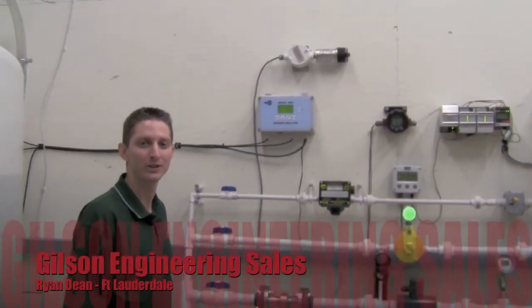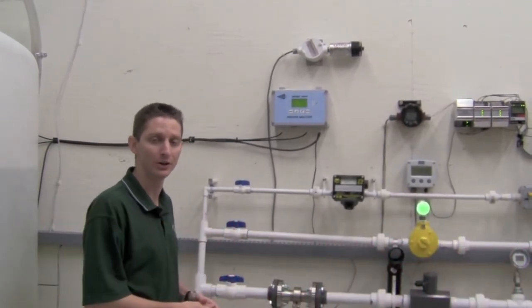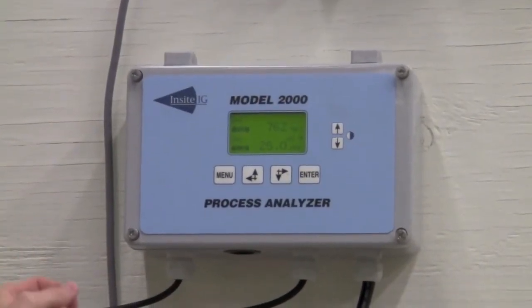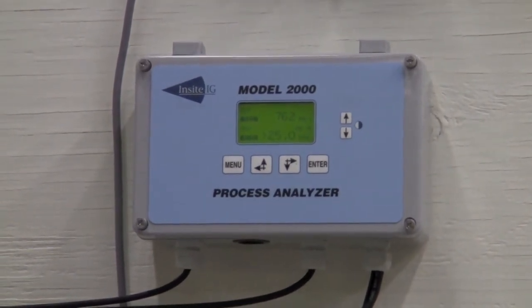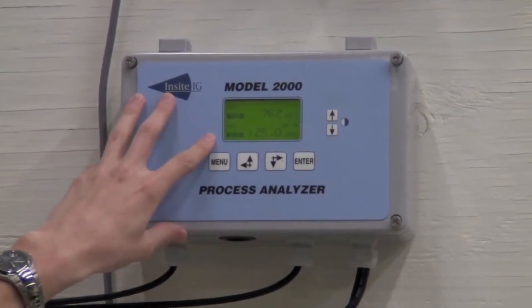Hi, I'm Ryan Dean with Gilson Engineering Sales of Florida in the Fort Lauderdale office. We're here today in the Gilson Engineering flow lab and I'm going to give you a brief demonstration on how to set up and program an Insite dissolved oxygen and total suspended solids monitor.